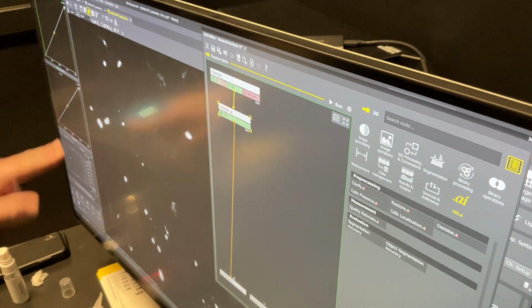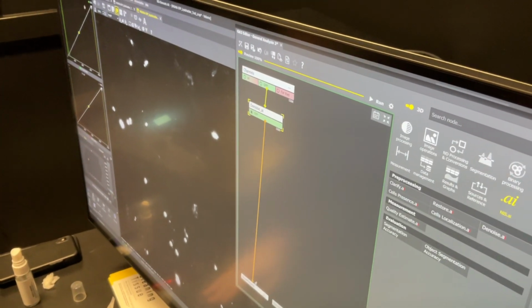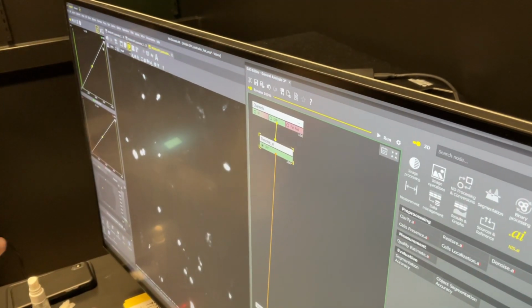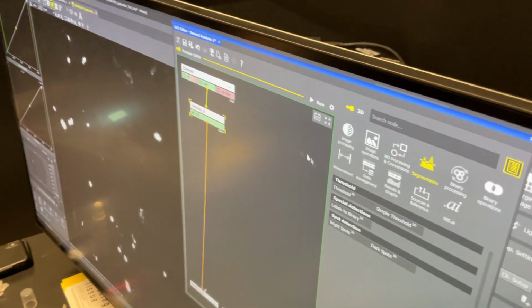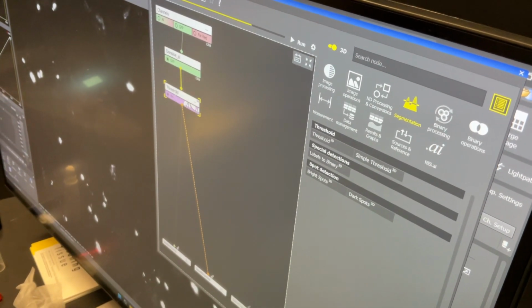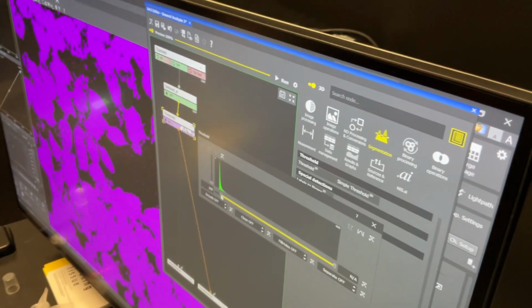So again, everything is saturated. Just be aware, this tool right here, when you're setting up, can be very helpful. That'll give you red pixels wherever your saturation is. Gotcha. All right. So then we just jump over to our threshold, drop it right on top. So it's going to be even easier in many ways.